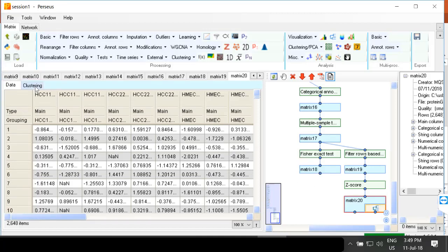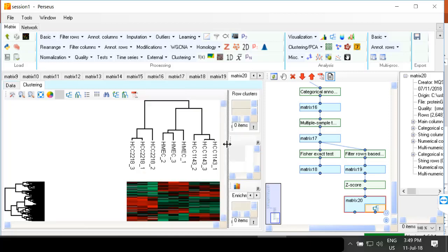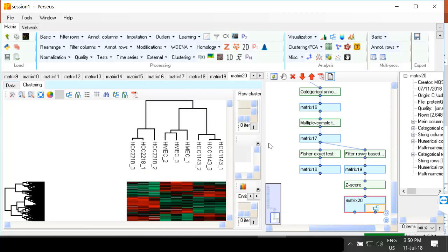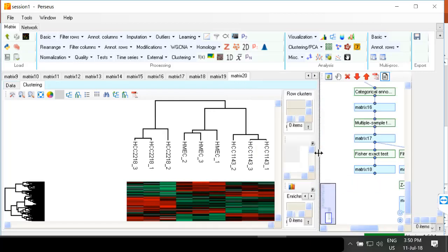You see that it's really super fast. It's already there. So the first thing that you see, and this, of course, you would expect, so it's not a big surprise, is that all of our biological groups are clustered together. All of the replicates are clustered perfectly.